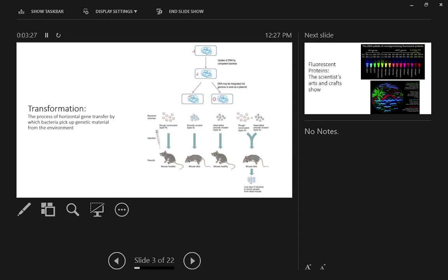That's weird. What we were able to determine from this, and in part this experiment was really successful by dumb luck, is that this bacteria does like to take up DNA from its environment rather readily. Not all bacteria do that. Some bacteria are exceptionally picky and will not take up DNA from the environment. In this case, this one does. It's greedy. It likes to take up stuff that it randomly finds and either incorporate it into its own genome or make a little plasmid, and that's what happens in this case.